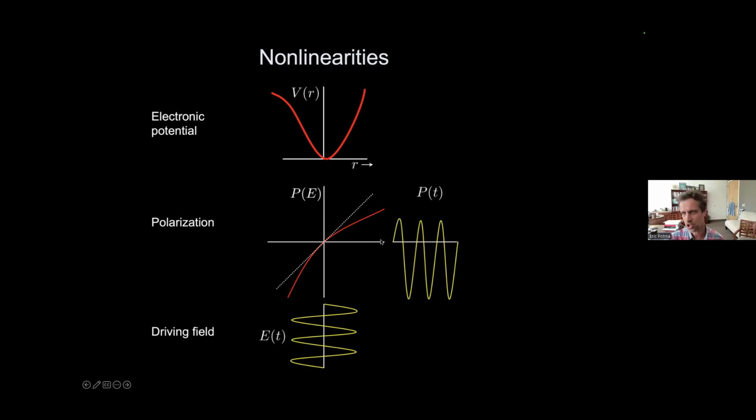So you get a pretty high polarization, negatively signed, but still much larger in size. So you get this kind of nonlinear dependence of the polarization on the electric field. And that leads to distorted shapes of the oscillation. You can see here that now on one side, the negative side of the oscillation, it's much deeper, and on the positive side, it's kind of truncated. So this is now a distorted waveform. Okay, so you start distorting the waveform if you lose this linear dependence, right?